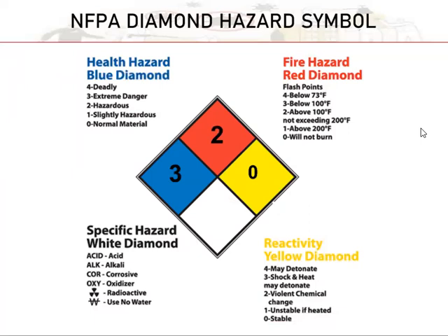Okay, so number 3, the blue diamond. This one class indicates the level of hazard the chemical possesses to the health. So we have this scoring system, 0 to 4. 4 is deadly. So we can assign numbers based on the unsa iyahang health hazard. The number 2, red hazard. So, red indicates a chemical's degree of flammability. Unsa ba na temperature? Pila ba ang degree Fahrenheit for it to create a fire? So, naa po na siya 0 to 4.